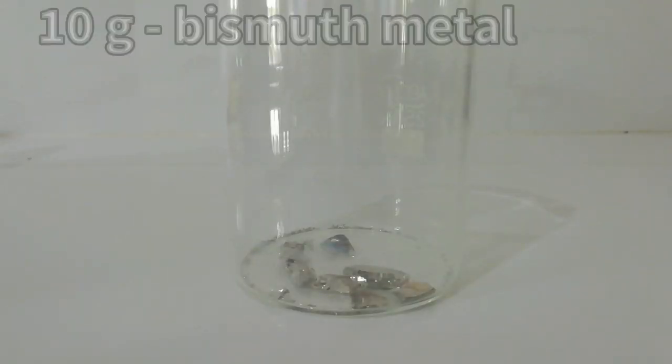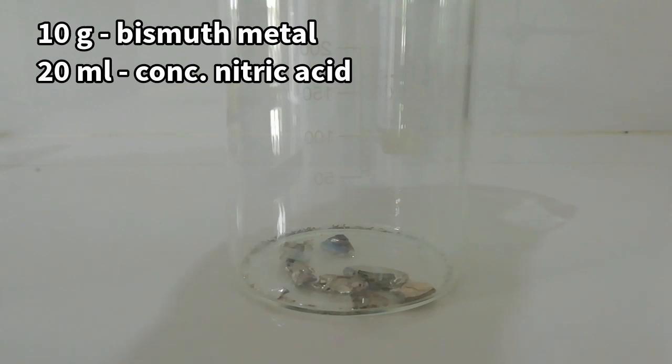First, 10 grams of bismuth metal was placed in a 200 milliliter beaker. Then 20 milliliters of concentrated nitric acid was added.